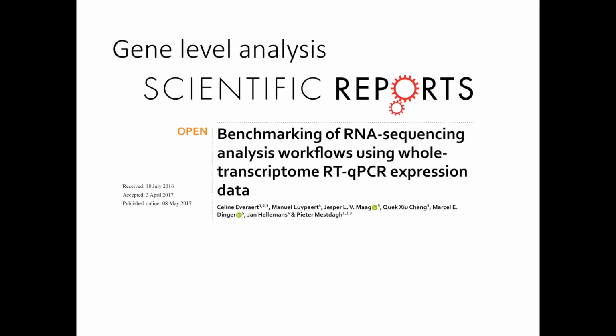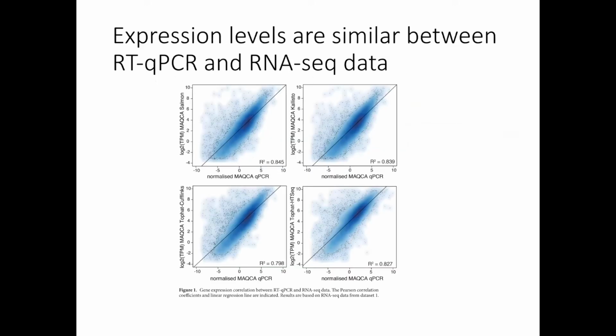So the good thing is that the programs that are out there, and the steps that are used, are all behaving quite well. But in this paper, they wanted to ask: do you get the same results when you're using qPCR as when you're doing this RNA sequencing analysis to get the counts from the reads? And the answer is yes.